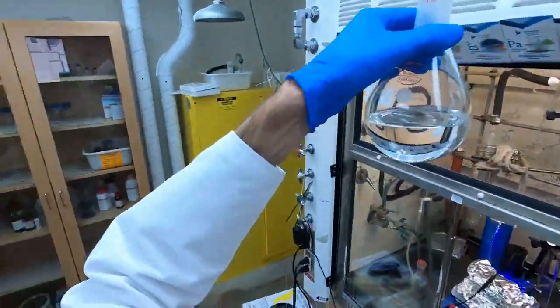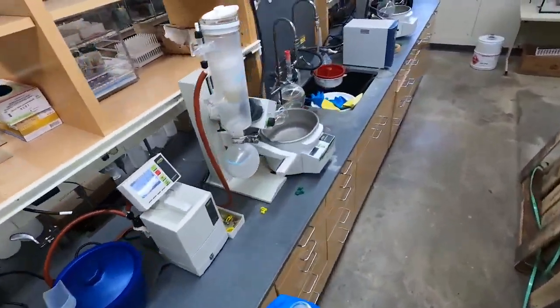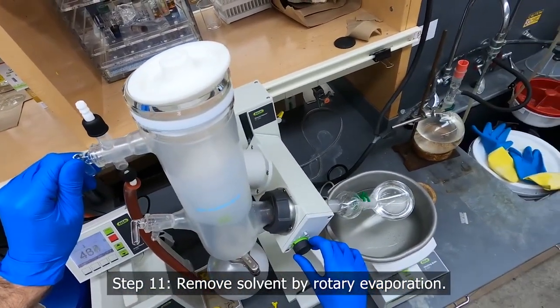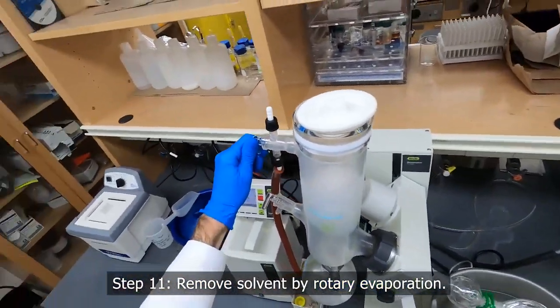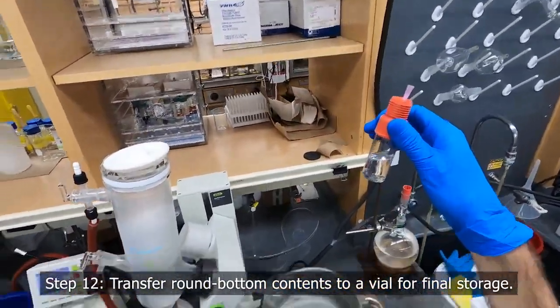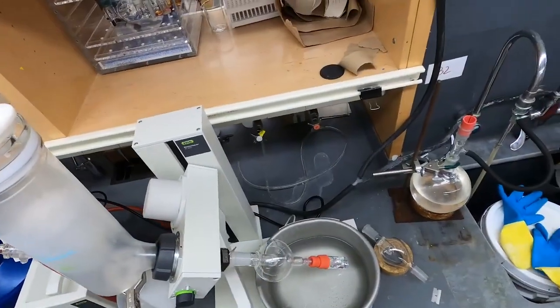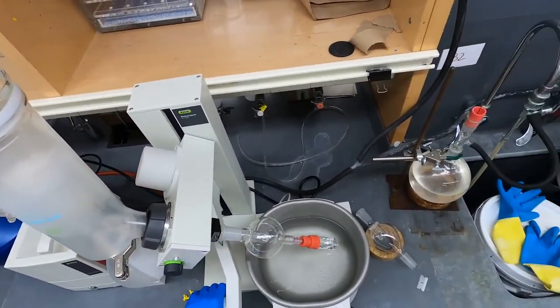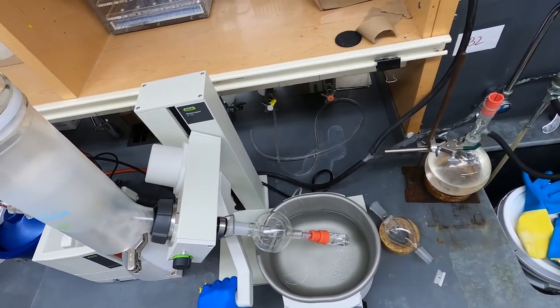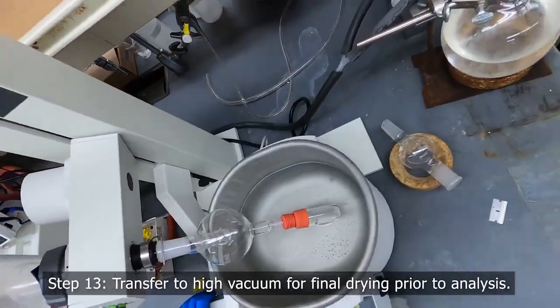Okay, so we've transferred our fractions to the round bottom flask and we are ready to rotovap this. Okay, so we've transferred our product from the round bottom into this little vial, and we will dry it on the vacuum line to remove all of that residual solvent once it's rotovapped down, and from there we'll be able to analyze the product. Okay, looks like it's done.